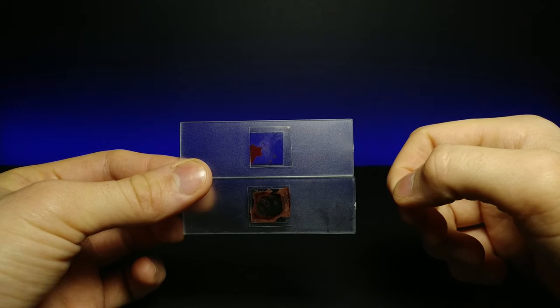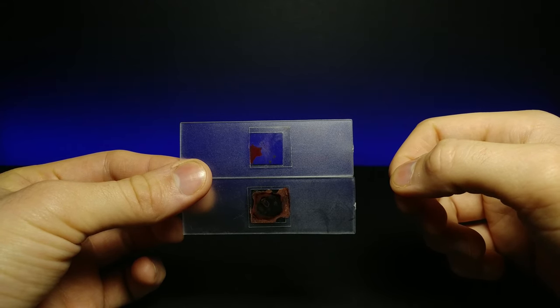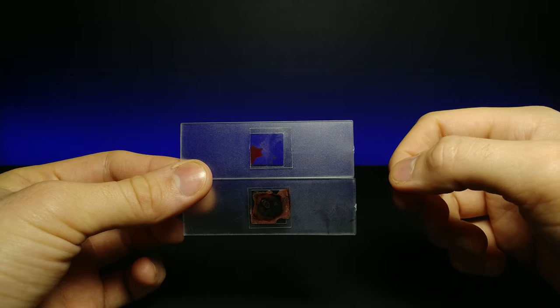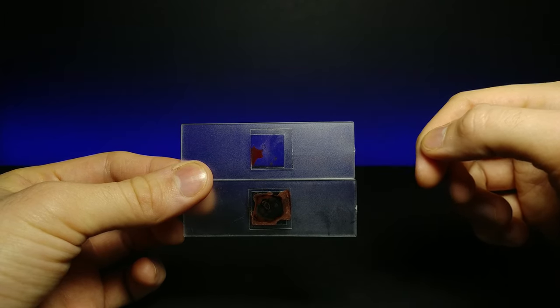Let's go ahead and check out the microscopic world. Alright, so the first slide we're going to be doing is the live human blood. Let's go ahead and put this on here. I'm going to go ahead and find the blood itself.